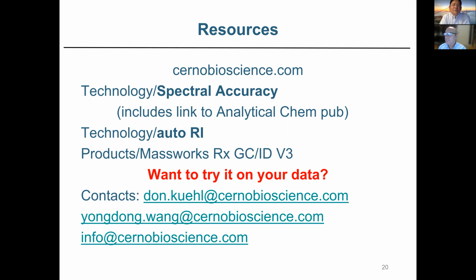Another question is, for those who want to use external standards, do they have to use alkane standards, or can they use their QC standards? No, you don't. You can use any compounds that you want. In fact, some people have a test mixture or validation mixture that they run every day on their instrument.